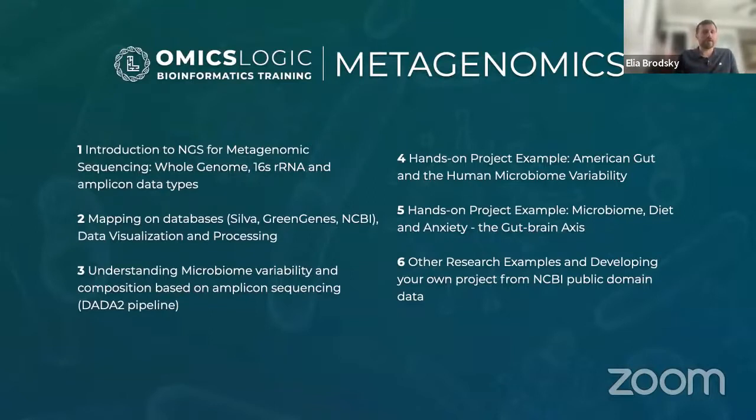But in many cases, we want to give you the flexibility of going through the topics that we have planned. And so that is why all of the sessions will be recorded, but also sometimes you will have access to structured material on our OmicsLogic portal, which will include text, images, video, quizzes, exercises with coding or running pipelines.